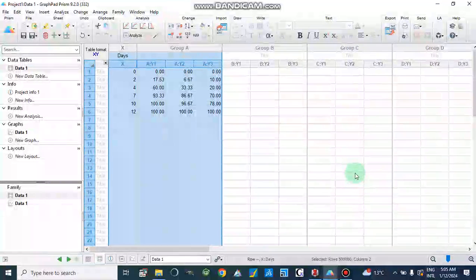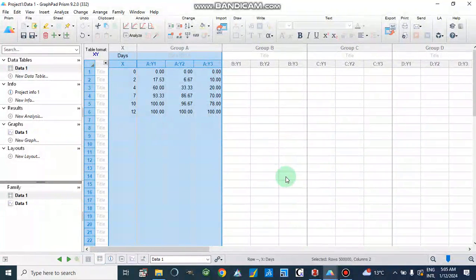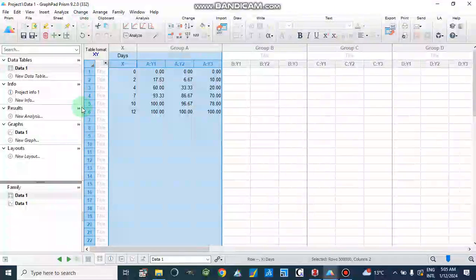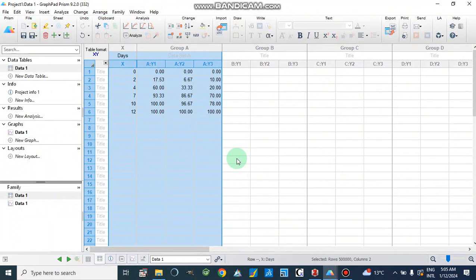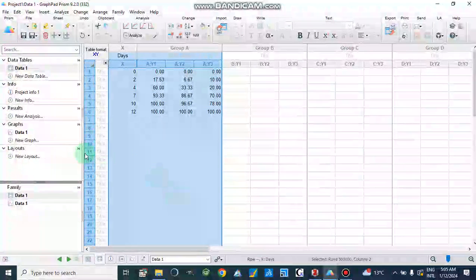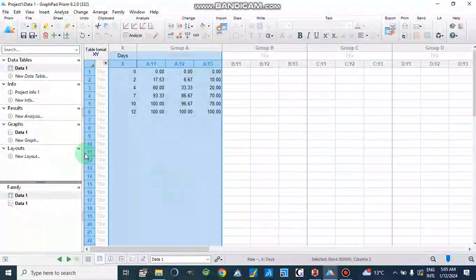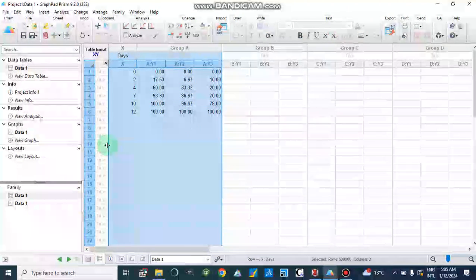Dear viewers, Assalamualaikum. Today we will discuss another tool in GraphPad Prism 9.2. In this tool we will discuss how we can analyze our data like antibacterial activity or wound healing activity, or different types of data in which we can make graphs along with standard error of mean or standard deviation.